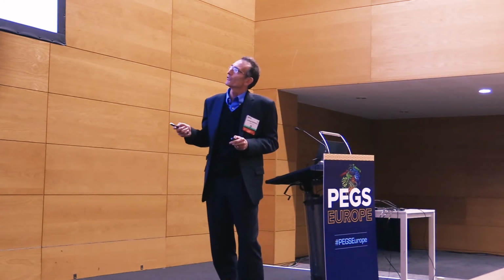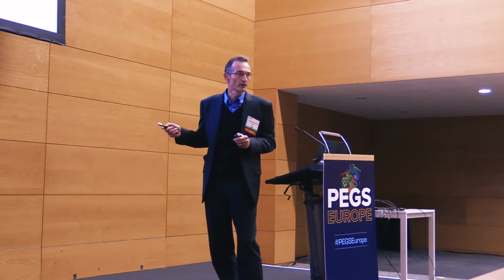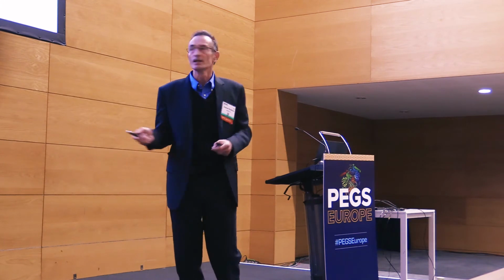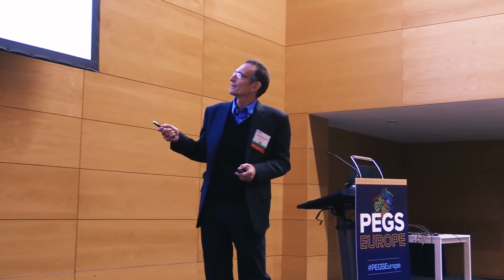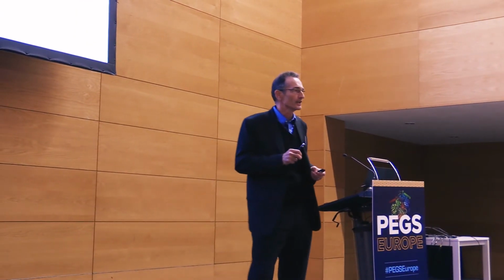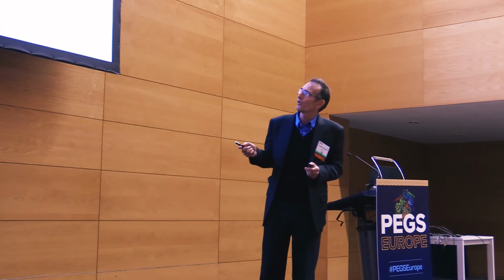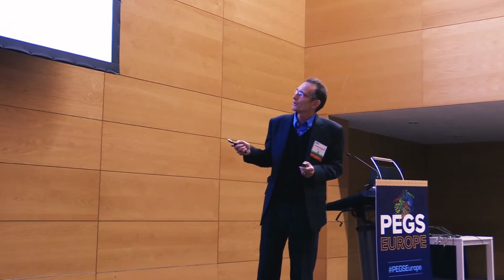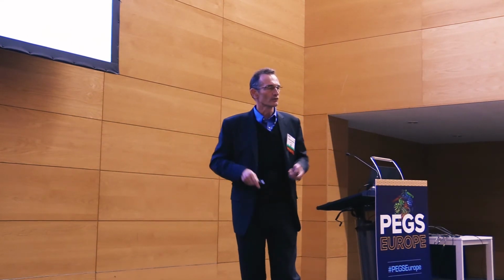So this shows now the natural replicated diversity. So here what we have is the natural CDR abundance range, which goes from 300,000 to 1, from the most abundant to the least abundant. So if you naturally amplify CDRs from a population and you use that to make a library, this is the abundance range from the most to the least abundant that you will see. This, on the other hand, is the abundance range for natural replicated CDRs, which are synthesized in oligos. Unfortunately, they're not quite as good as claimed, so very often we see 1 or 2 oligos that seem to be about 10-fold more abundant than the rest. But nevertheless, the abundance range of these is about 1,000 to 10,000 times better than if you were to go to the natural source.